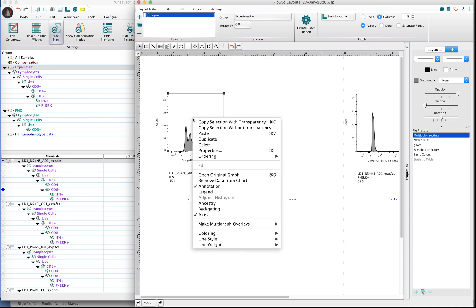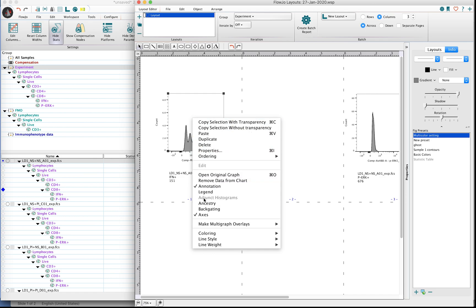If I right click on the plot, you'll notice there's a drop-down menu that has a lot of different options. Towards the middle pane, and towards the bottom of the middle pane, you'll see an option that says Ancestry.